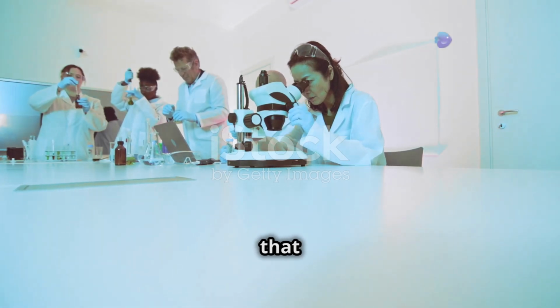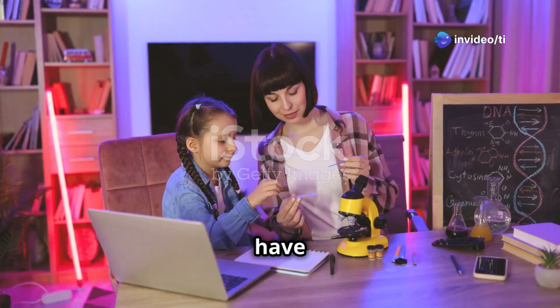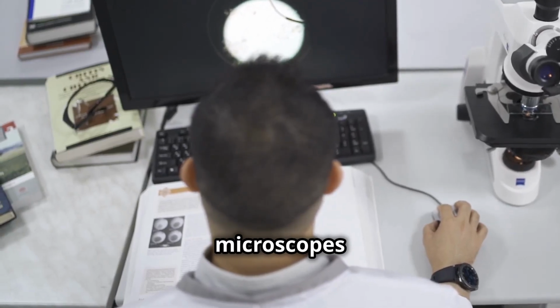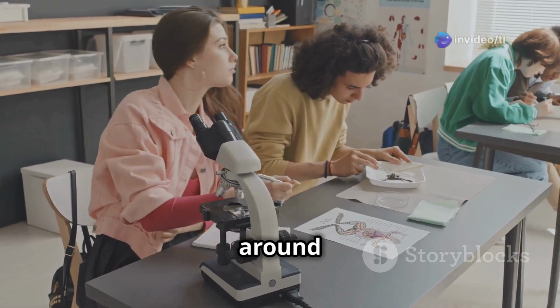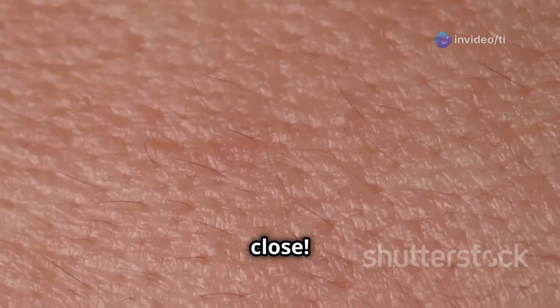You might be surprised to learn that microscopes aren't just confined to laboratories and research facilities. They have found their way into our homes too. Have you ever seen those USB microscopes that plug right into your computer? They're great for hobbyists, students, and anyone curious about the microscopic world around them. Imagine examining the intricate details of a flower petal, a snowflake, or even your own skin up close.